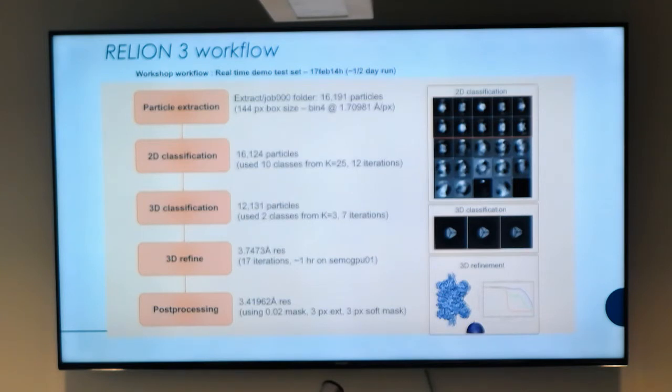And now what happens if you're in a research program and you're in a regime where you have multiple data sets, dozens of data sets, this can assist you with prioritizing and giving you indications where, yes, I might have a 3.4 angstrom resolution map, but okay, I'm actually after a ligand, or I'm after a component that's binding there and it's not there. And you can say, well, is it really not there, or is it just very flexible?